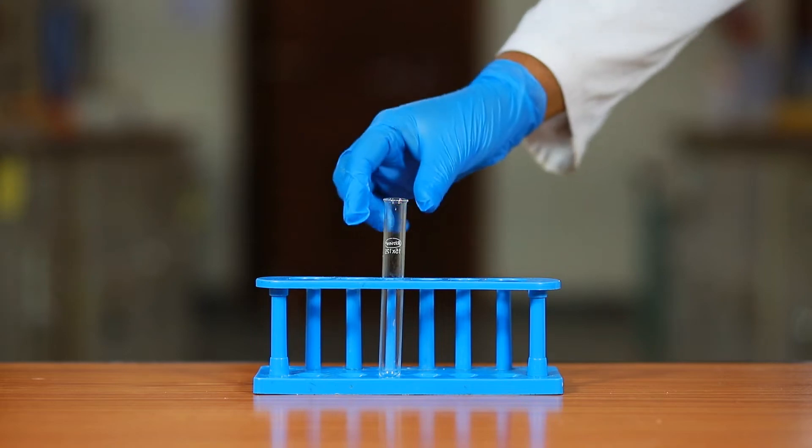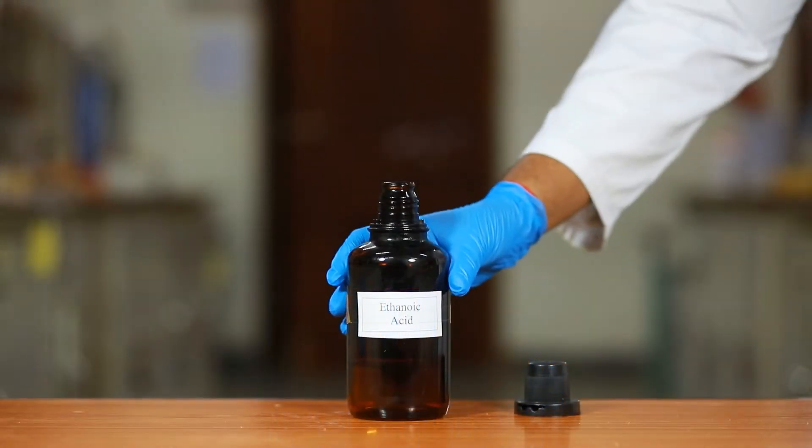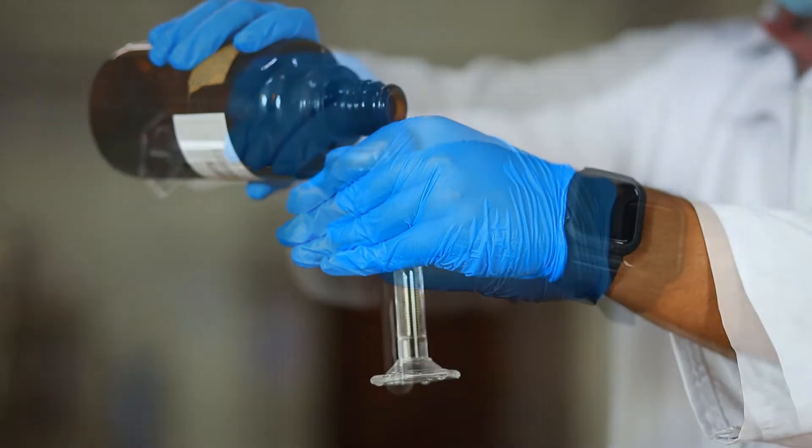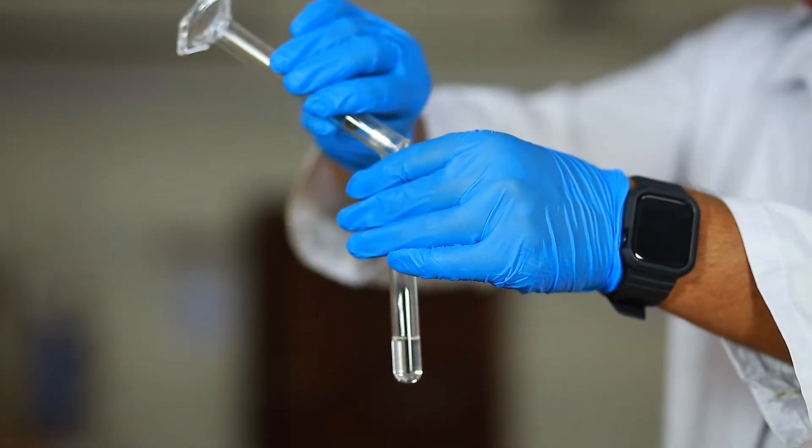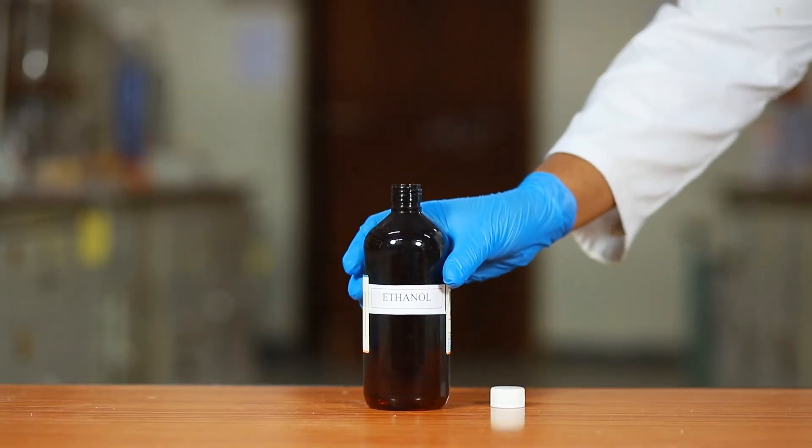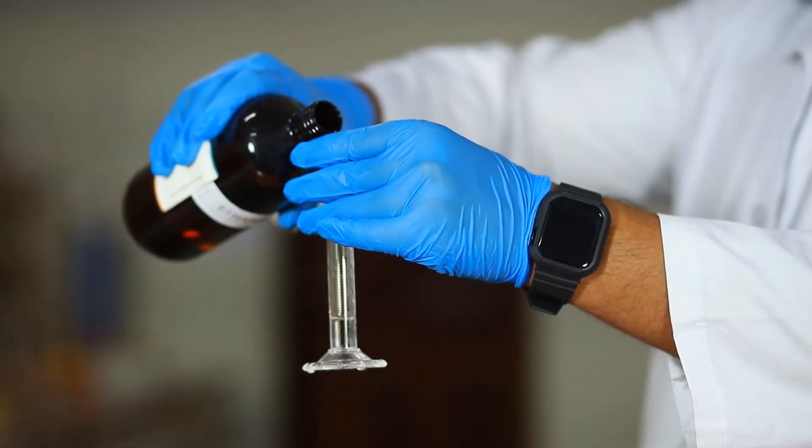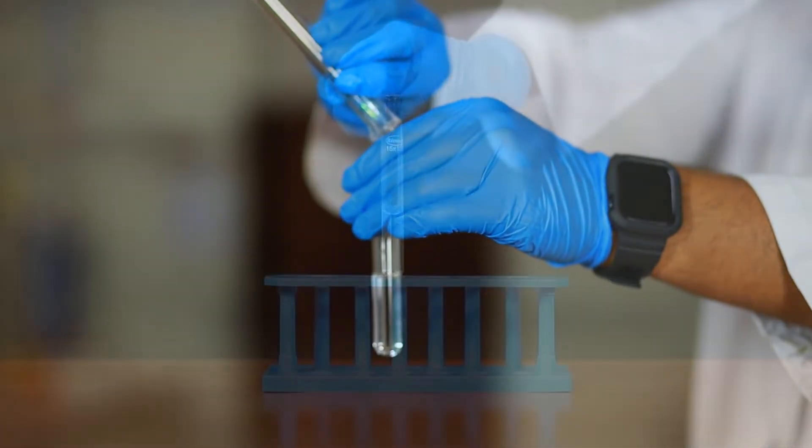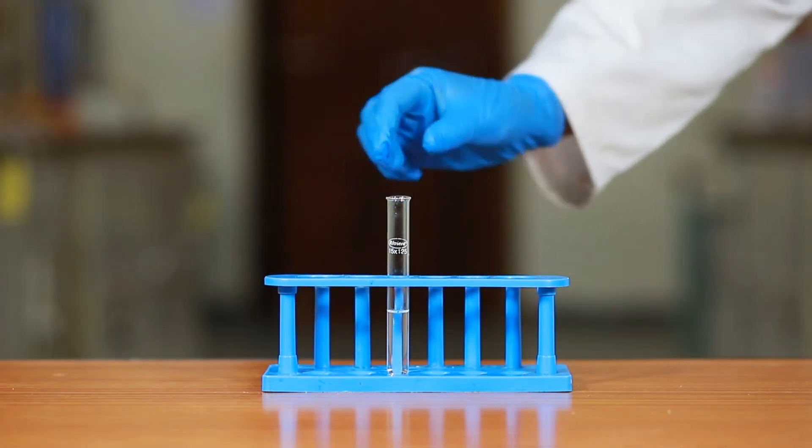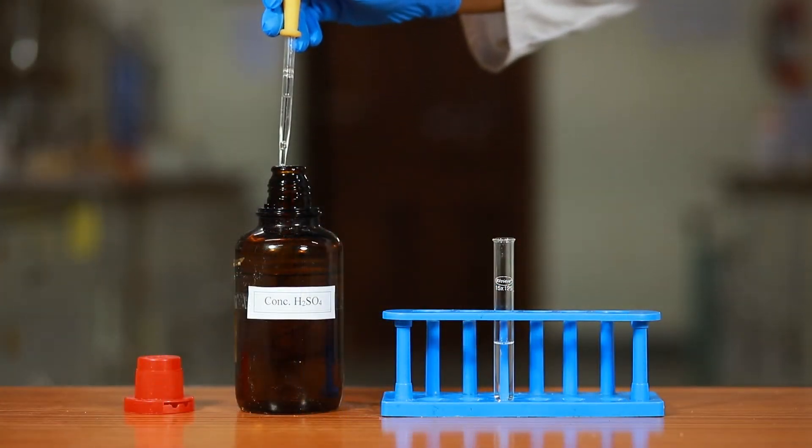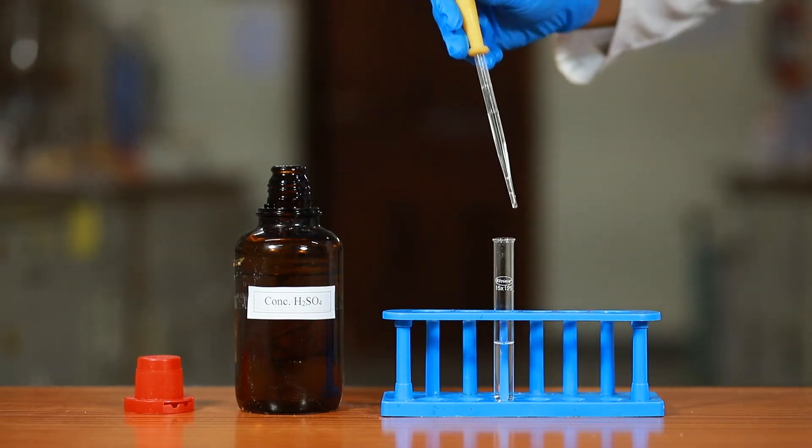Take a clean test tube in the test tube stand and add 3 ml ethanoic acid using a measuring cylinder. Add 3 ml ethanol to the test tube containing ethanoic acid. Add 4 to 5 drops of concentrated sulfuric acid to the reaction mixture using a dropper.